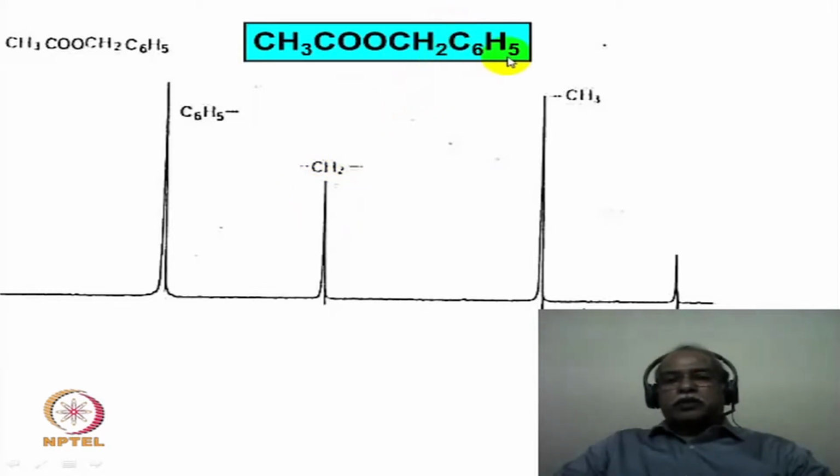The monosubstituted benzene phenyl derivative should have appeared as a multiplet because the ortho, meta and para hydrogens are not chemically equivalent. They should have given 3 different chemical shift values. However, the CH2 group is not a strongly perturbing group. It is not a strongly electron donating or electron withdrawing group. It is only a carbon based substituent, and does not have much of an electronic influence on the phenyl derivative. So as a result, the ortho, meta and para hydrogens accidentally come in the same chemical shift region, appearing as what seems to be a singlet for the phenyl derivative.